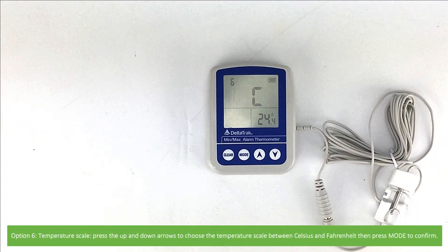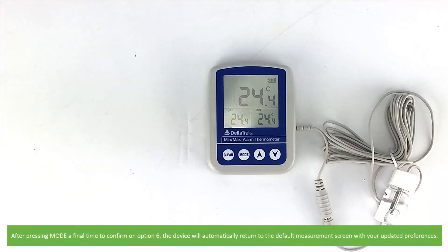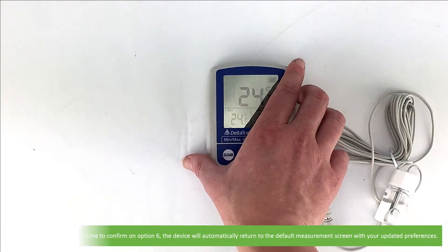Option 6 is the temperature scale. Press the up and down arrows to choose between Celsius and Fahrenheit, then press Mode to confirm. After pressing Mode a final time to confirm your selection on Option 6, the device will automatically return to the default measurement screen with your updated preferences.